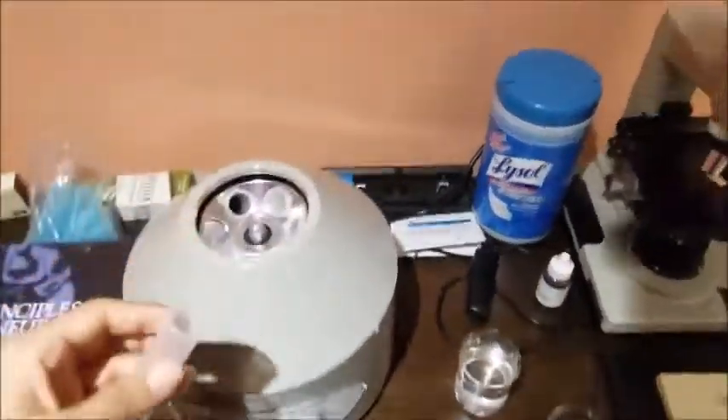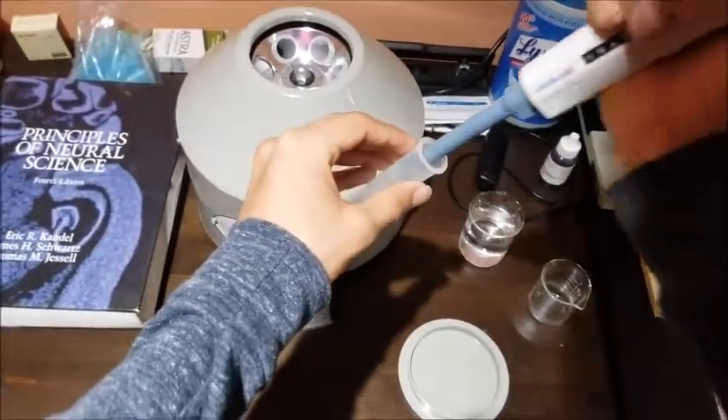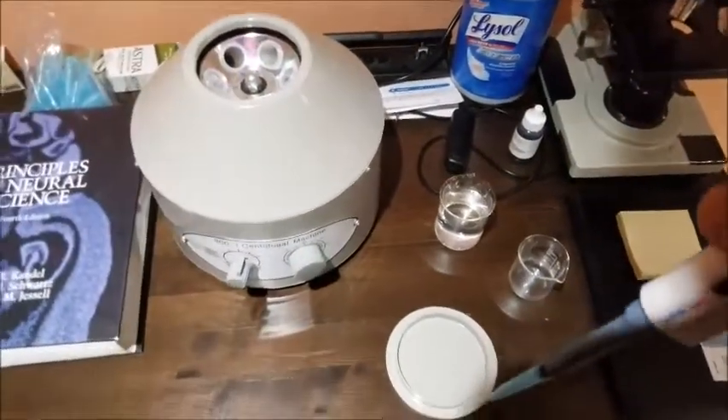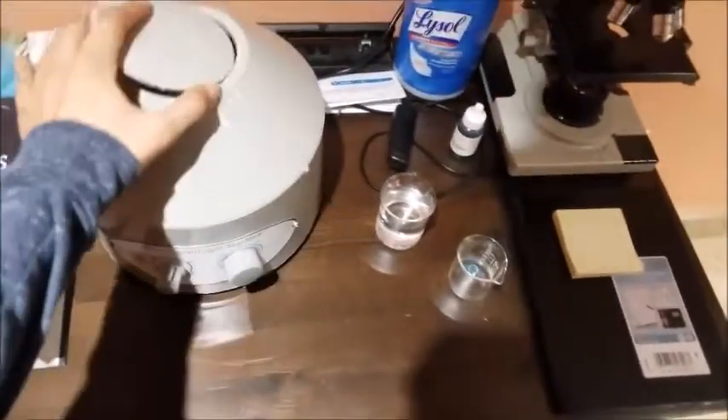So I take tube four, then take another one milliliter of solution, add it into tube four, and then replace that tube into the centrifuge. I discard my tip and then close the lid.